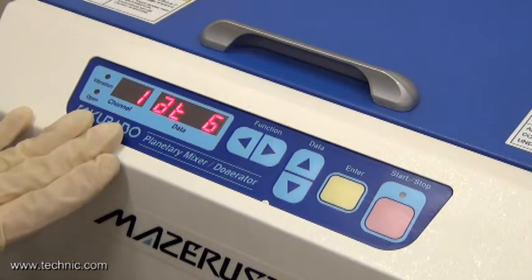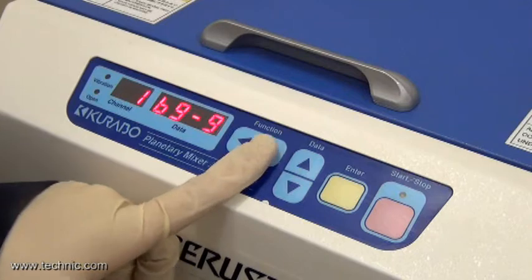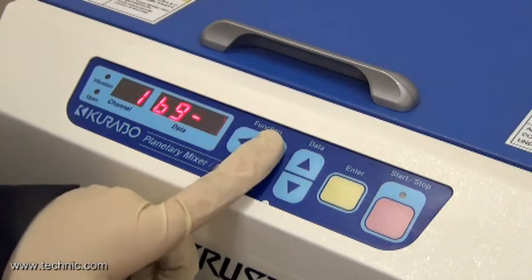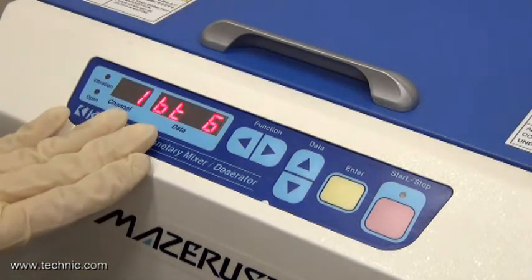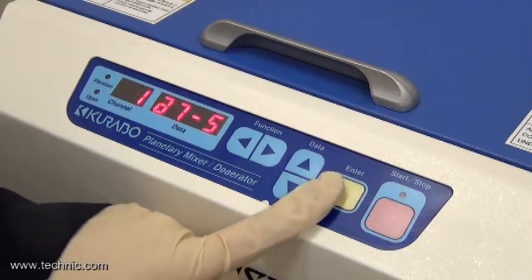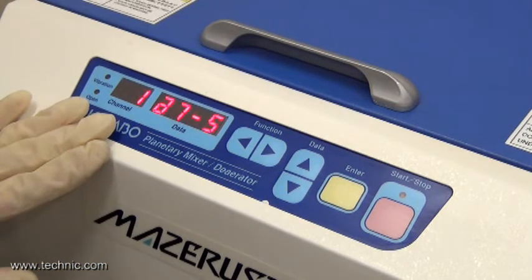For step B, we have set the revolution and rotation speeds at 9, which is full speed, for 1 minute. Now, all we have to do is press start.